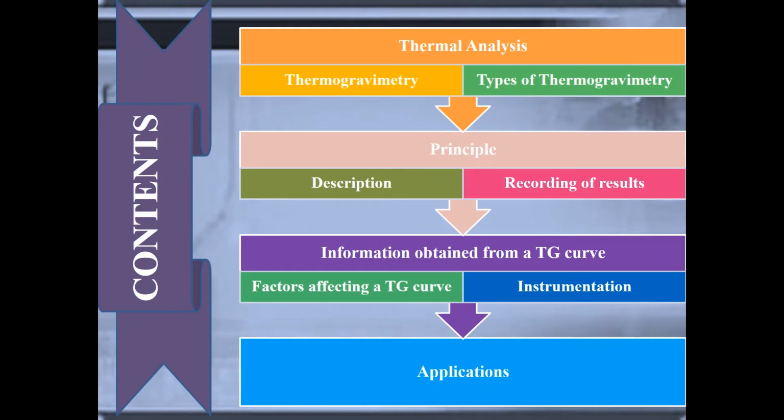Thermal analysis. Now, it's further divided into thermogravimetry and types of thermogravimetry. It relies on a principle, that is description, recording of results, information obtained from a TG curve, factors affecting a TG curve, then of course the instrumentation, and then that finally leads to applications.